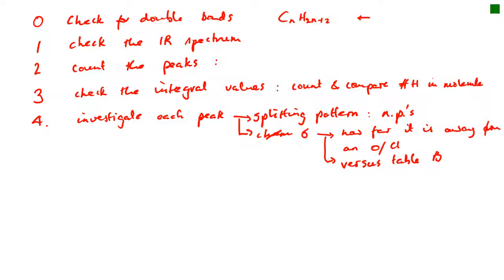And once you've done that, you're going to construct a whole molecule. Alright, so last step, construct a whole molecule.